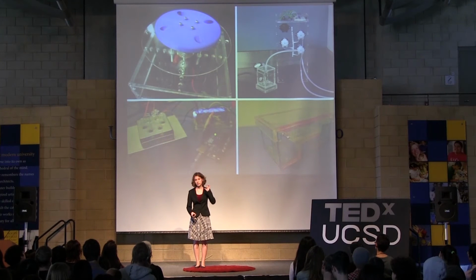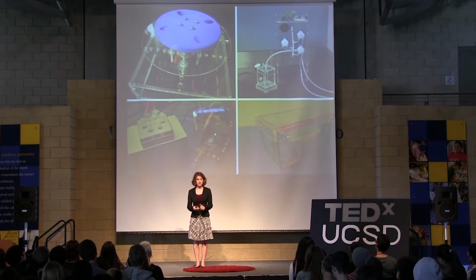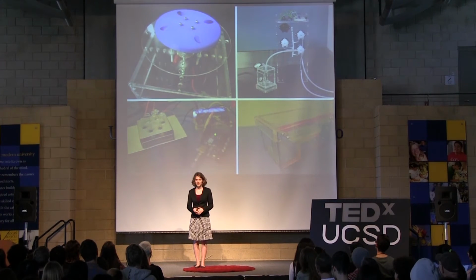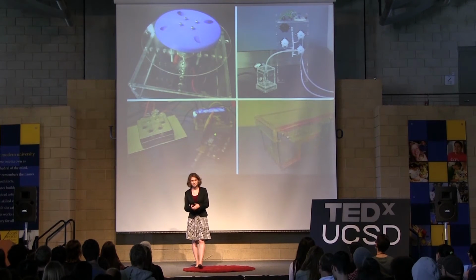And for that, we use a polymerase chain reaction. What that does is amplify a gene of your choice, and we have chosen a gene that's specific to HIV and only found in that virus. So if anything is copied in this reaction, that means that there was virus present. But if there was no HIV virus present in the sample, then nothing will be copied at the end of the reaction. So then all that's left is measuring if there's any product or if there's no product after this reaction has completed. And for that, we use gel electrophoresis.